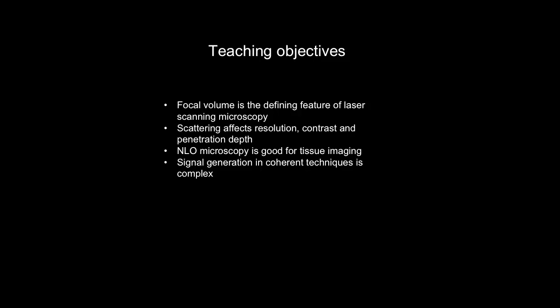We don't want to work with high energy because of photodamage, so it requires short pulses. We use femtosecond and picosecond pulses, and these lasers are more expensive than the CW lasers that people use for reflectance or fluorescence confocal microscopy. So it is a complex and expensive technique to use, but it's worth it, I would say, because I work with it. Any other questions?